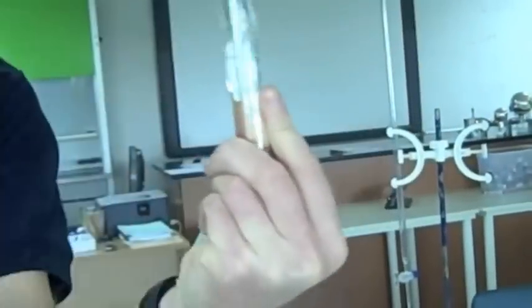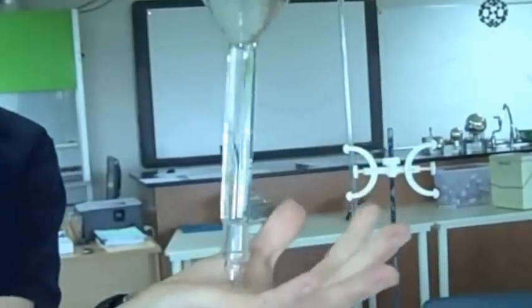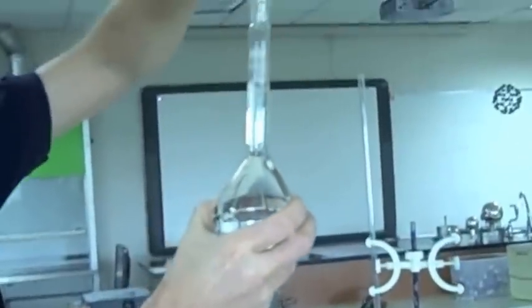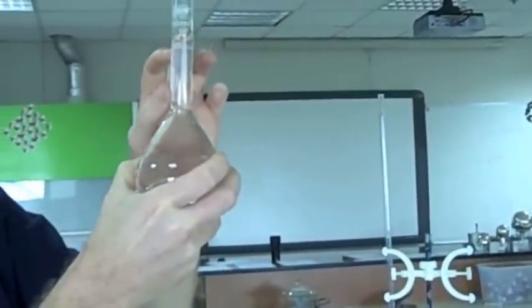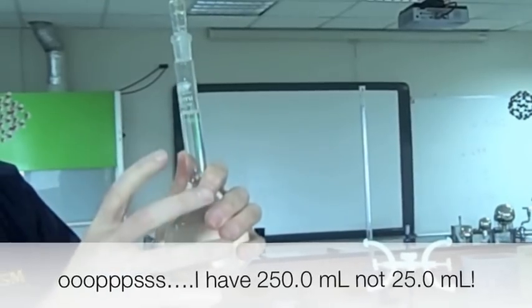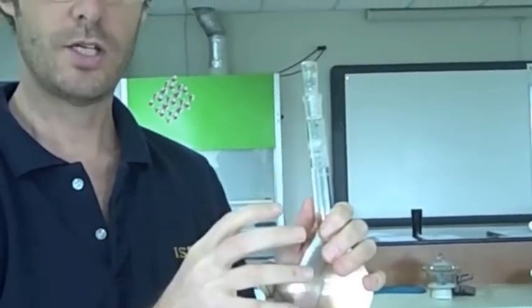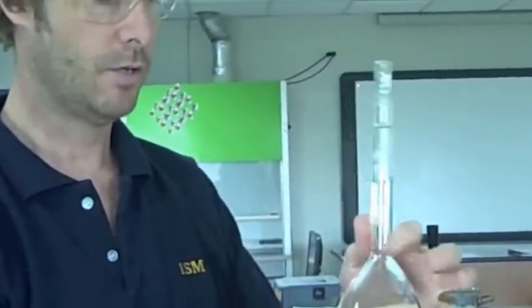We then put our ground glass stopper in, and to ensure proper mixing, we turn it over a good four or five times so we get a nice homogeneous solution. If I've done that correctly and my meniscus is on the bottom of my line, I have 250.0 cc's of my solution with a precisely determined mass of oxalic acid in it. That means I can find the concentration of this solution accurately later on.